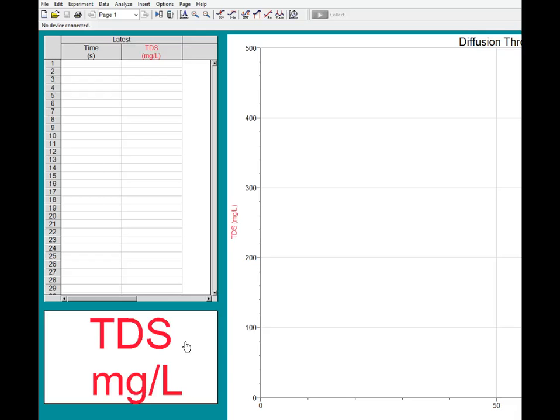And if we go down to step number 5, it says place the dialysis tubing containing the salt solution into the cup of distilled water, and then stir the solution slowly with the conductivity sensor or probe for 15 seconds. Again, you're only getting the end or the tip into the distilled water there, and you're stirring very slowly.